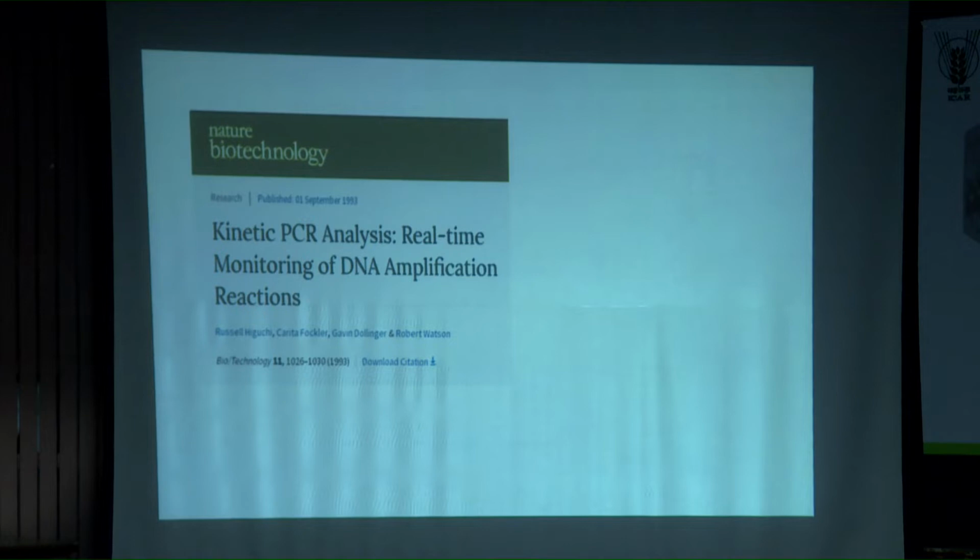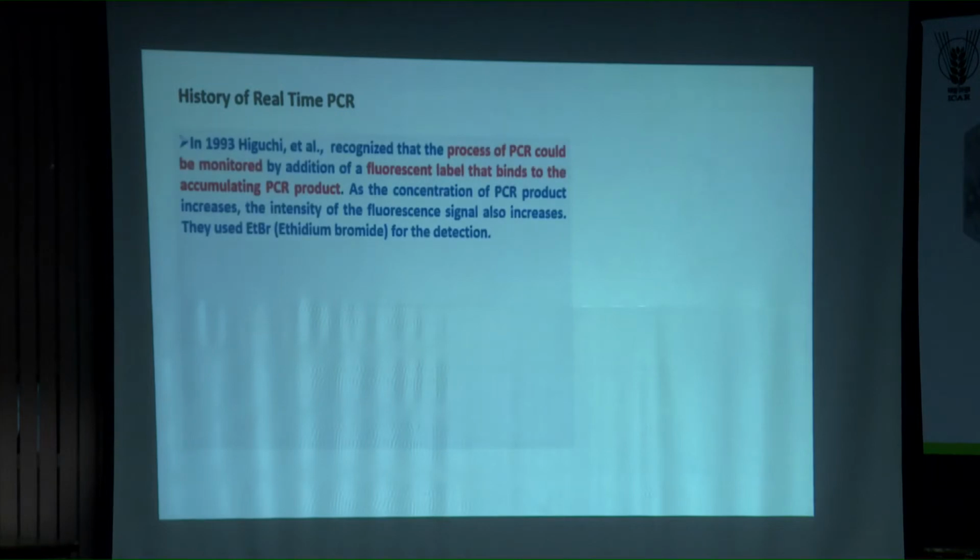So the paper appeared again in a very top-end journal, Nature Biotechnology. The title was Kinetic PCR Analysis: Real-Time Monitoring of DNA Amplification Reactions. Higuchi was working for Roche at that time, and they came out with a publication that is all about monitoring the PCR reaction by making small changes in the PCR cocktail.